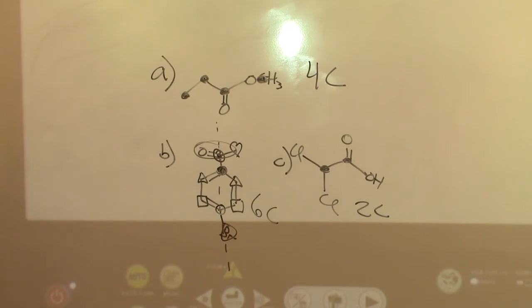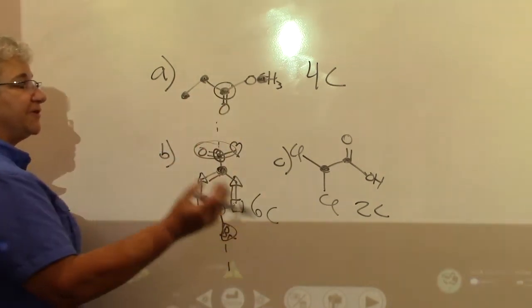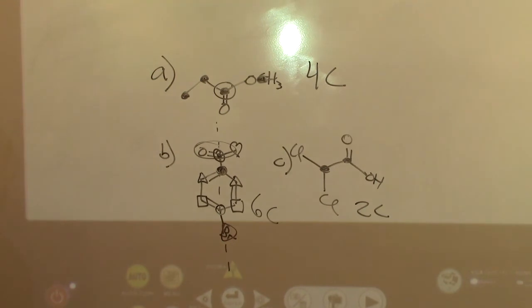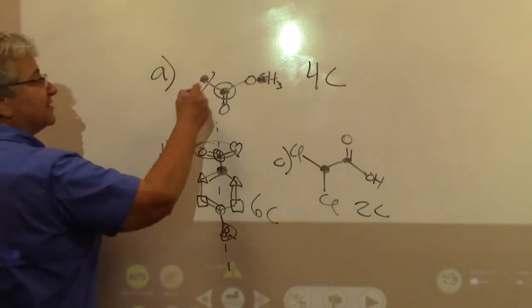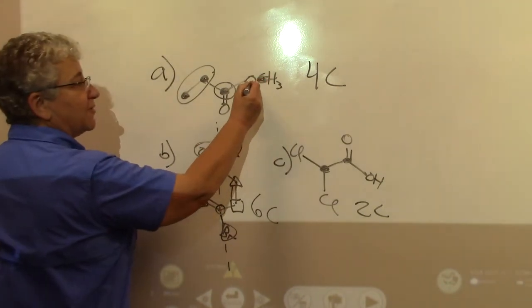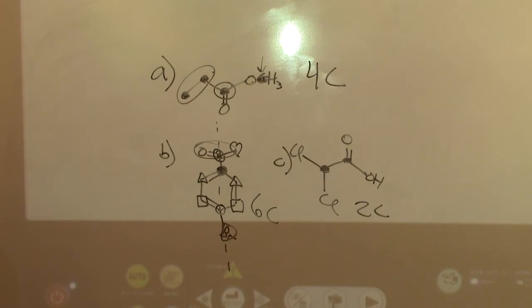The other thing to think about is where would you see these carbons? Right, so I'd see this carbon downfield in the 170 range. Right, I'd see these upfield in the alkane range, and I would see this carbon bound to an oxygen anywhere between 80 and 40.